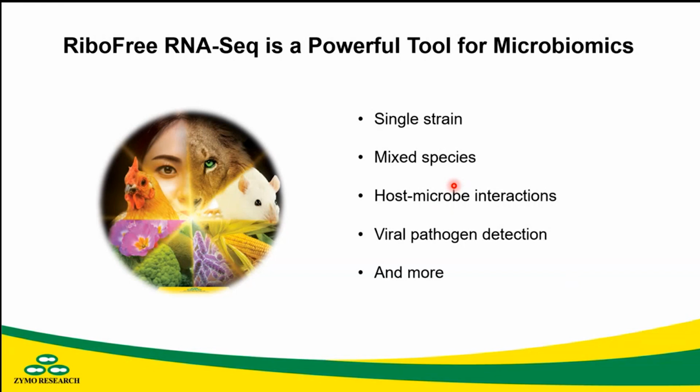On the other hand, for the MGI system, the vendor provides conversion kits. I believe there is an MGI conversion kit that has App A, application A, in its kit name, that will convert ribo-free libraries from Illumina structure to MGI structure.